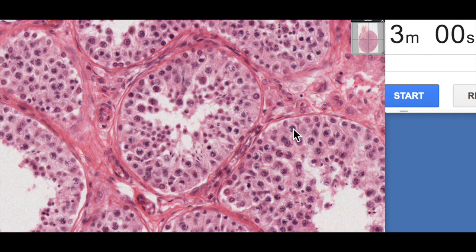G'day everyone, Jamie Chapman here for another episode of 3-Minute Histology. In this video, we're going to focus on the major cellular features within the seminiferous tubules — the spermatogenic cells, the Sertoli cells, and the surrounding structures. This testis isn't particularly well-preserved, so this video will help you interpret a similar poorly-preserved section. In another video, I'll show a well-preserved section where features are much easier to identify.